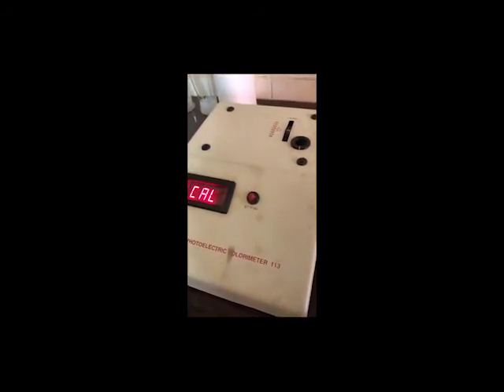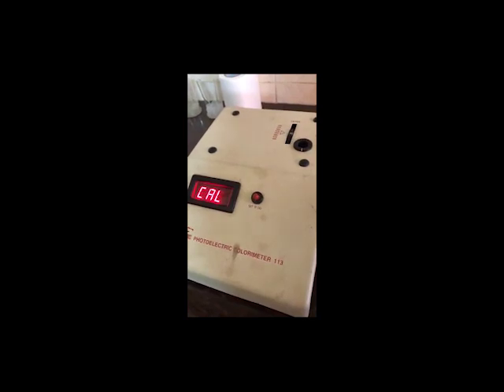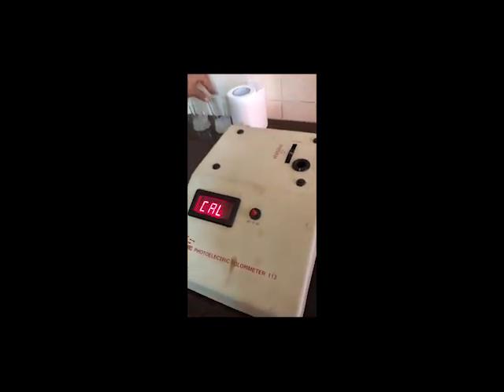Here I am going to demonstrate one measurement for a blank.